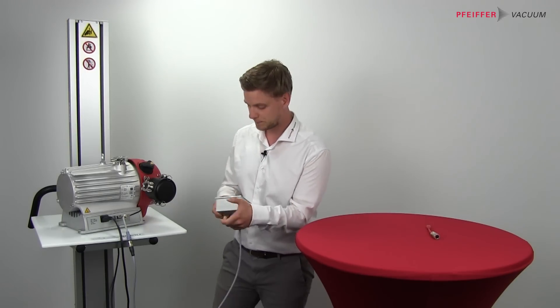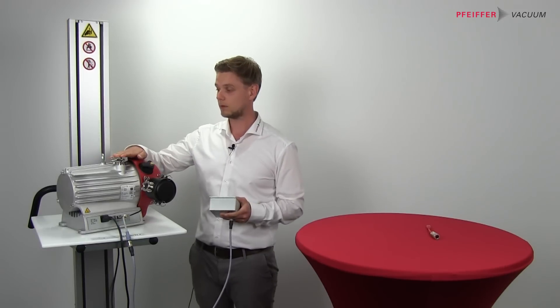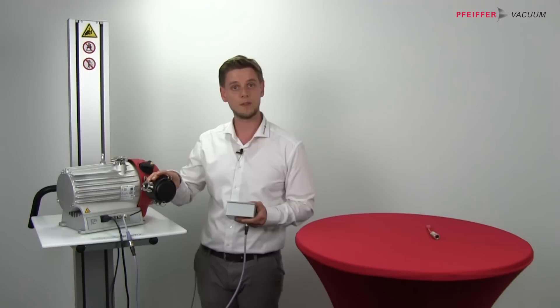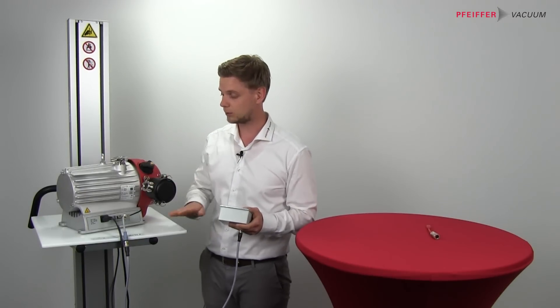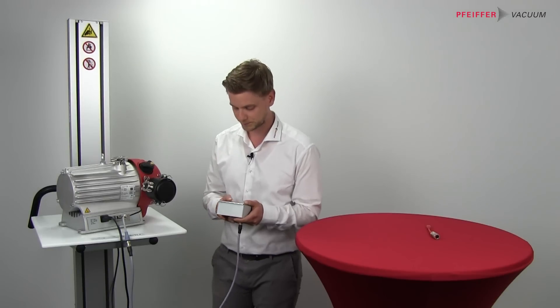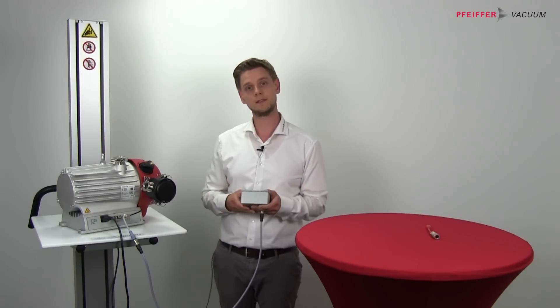So what have I shown you today? We have connected the blind flange at the pump. Also the filter for the dust of the tip seal. As well as the cabling to the DCU and the power plug. Now we are set up and can start the pump.